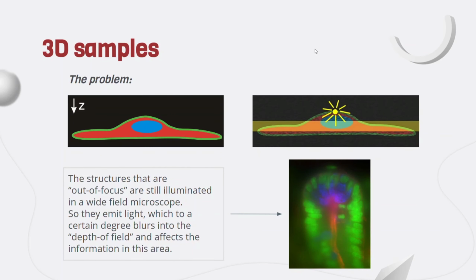They are not flat, 2D, they have a three-dimensional shape, so we have to consider the z-axis of depth. The resolution of the z-axis, axial resolution, is lower, the limit is 500 nanometers, while the lateral resolution of the x and y-axis has a limit of 200 nanometers. Given this fact that affects the quality of our images, we need an improvement in microscopy techniques that permit better resolution of 3D sample images.